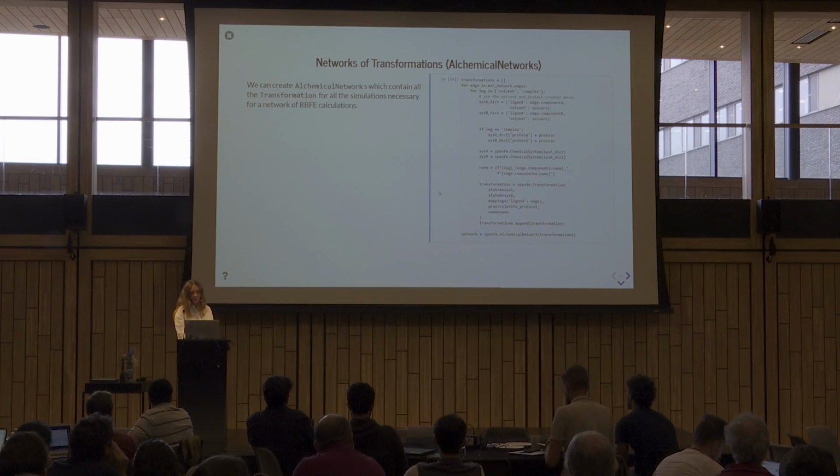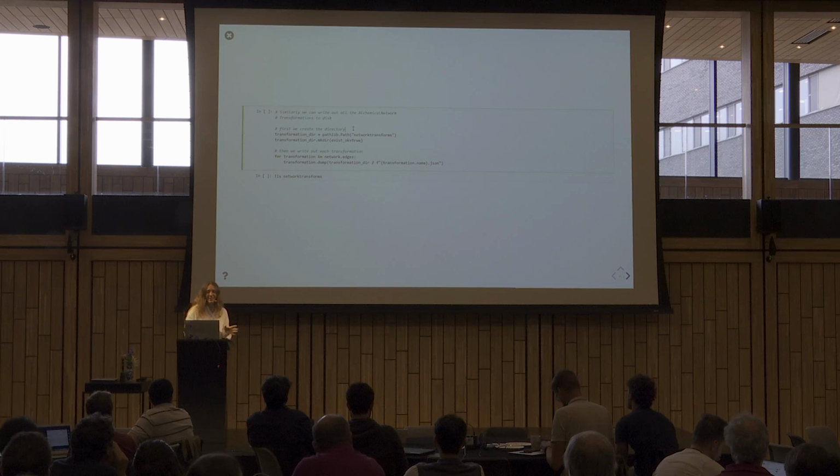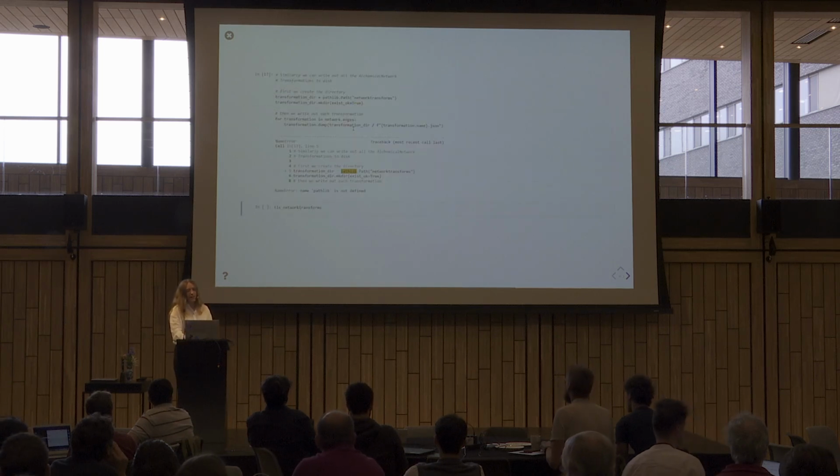Very fast. So for this, we don't actually need a cooking show. This is all very fast. And now we can, again, store all these transformations to disk. And I forgot to import something. I think I forgot to run some.